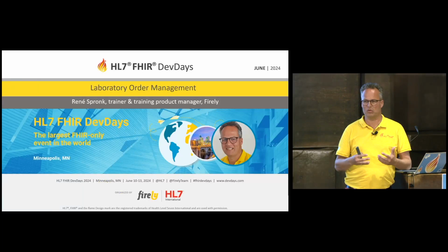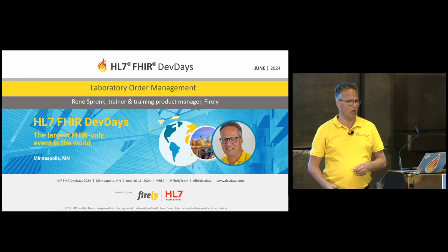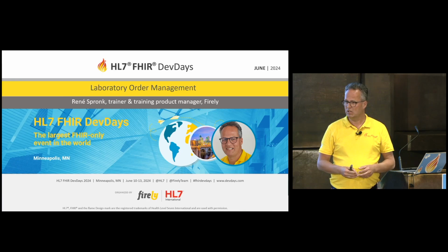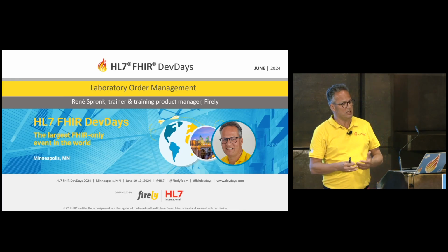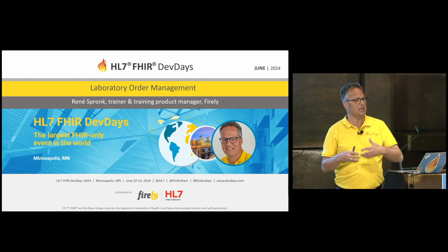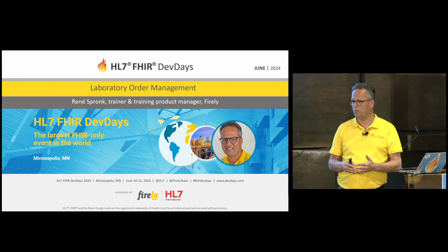Right, thank you. And yes, order management. If you were at this morning session or this afternoon session on messaging and documents, we also had some discussion around the workflow there. So how do you actually manage the workflow of a referral or an order, let's say for a laboratory test? In this presentation, I will be using the laboratory order environment and the results reporting as an example.